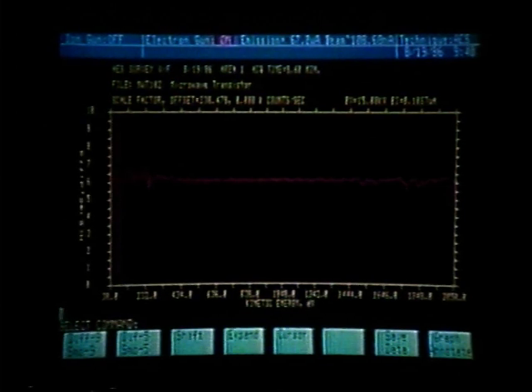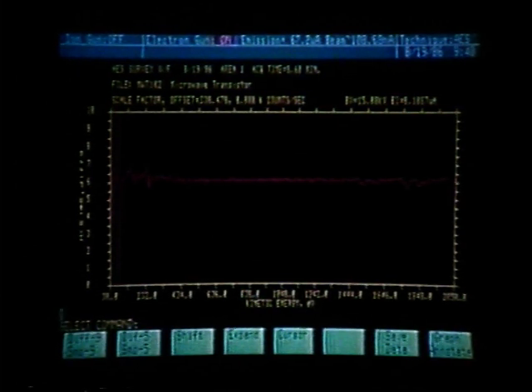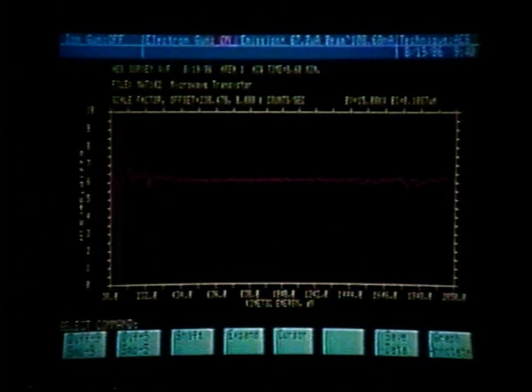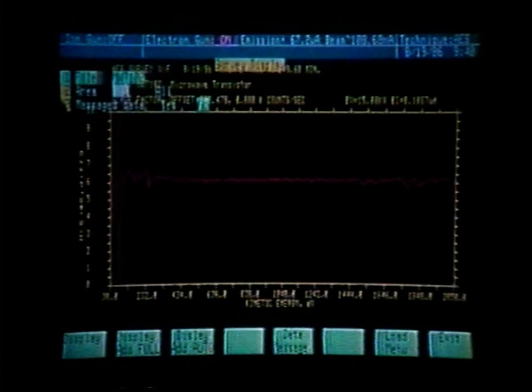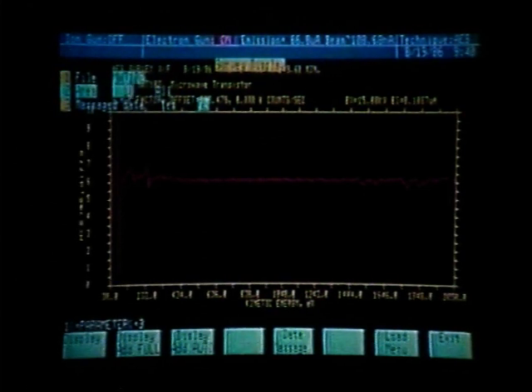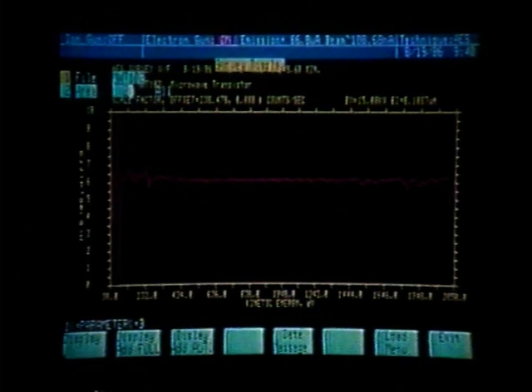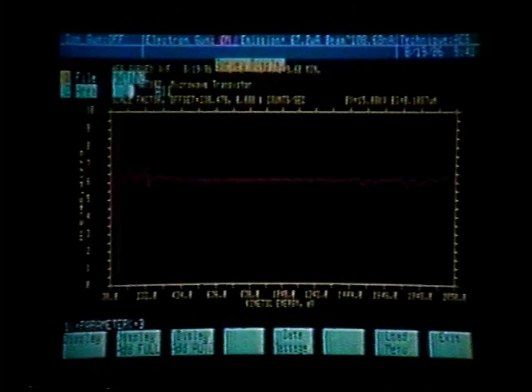To get back into the survey display mode, we use function key number 15 — the display and load key — activated by holding the shift key and pressing function key 15. Again, we are looking at area number 1. I would like area number 2, so I press function key number 2 to change the area number, type 2 and enter. I could display and add to this graph, but I want to look at only area number 2 to avoid confusion with peaks, so I press soft key number 1 again.